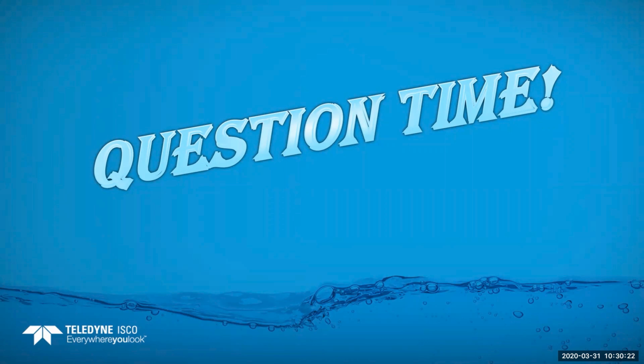So you have a booster pump that's down below less than the 32 feet, and it sucks the water up to the booster pump. And then from there, it pushes the water up to the top sampler. So really the only way if you have to go over 32 feet is to have some type of booster pump down below. You could also do a flow through chamber down at around 20 feet or 25 feet, somewhere in that range.